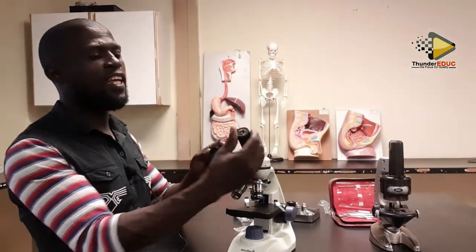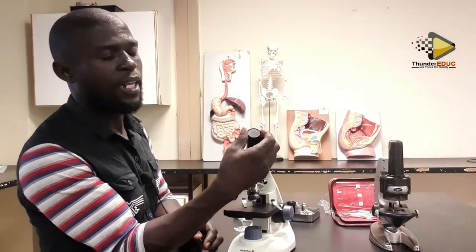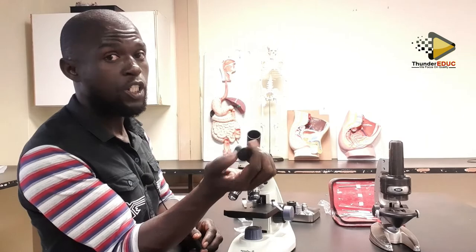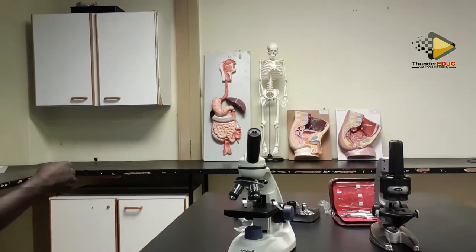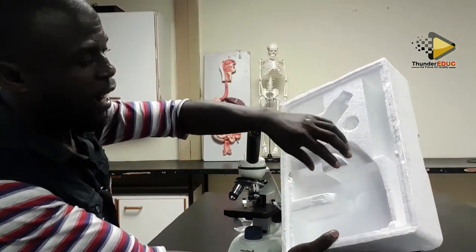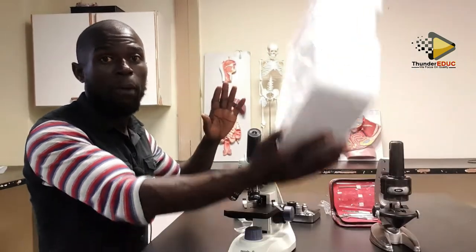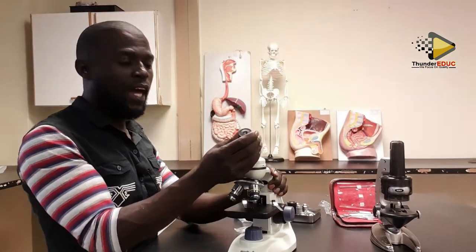So the first thing is the eyepiece. Some microscopes come with an eyepiece like this. This is not the eyepiece. This is the cover where the eyepiece goes. So you remove it and then you put in the eyepiece. The eyepiece is always given here in the box. When the box comes, you will see the microscope goes there, and then you have the different eyepieces there, depending on which kind of microscope it is. So this is the eyepiece.